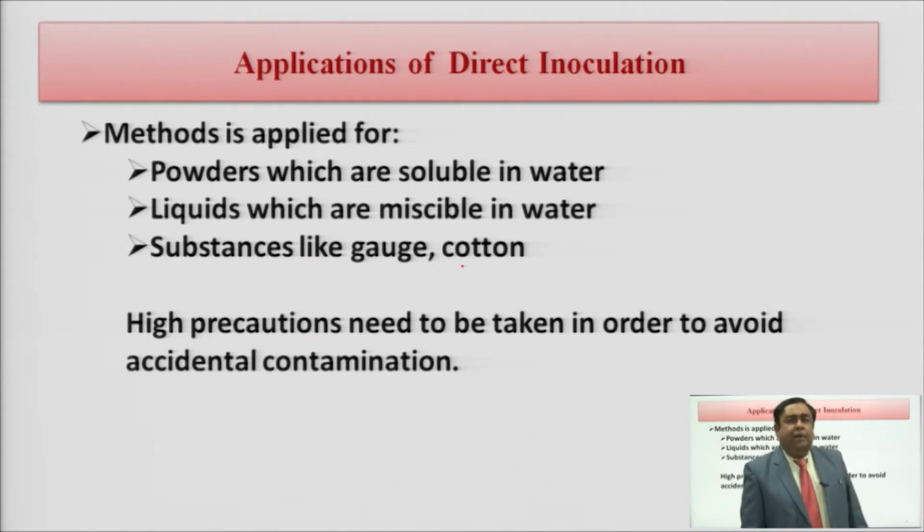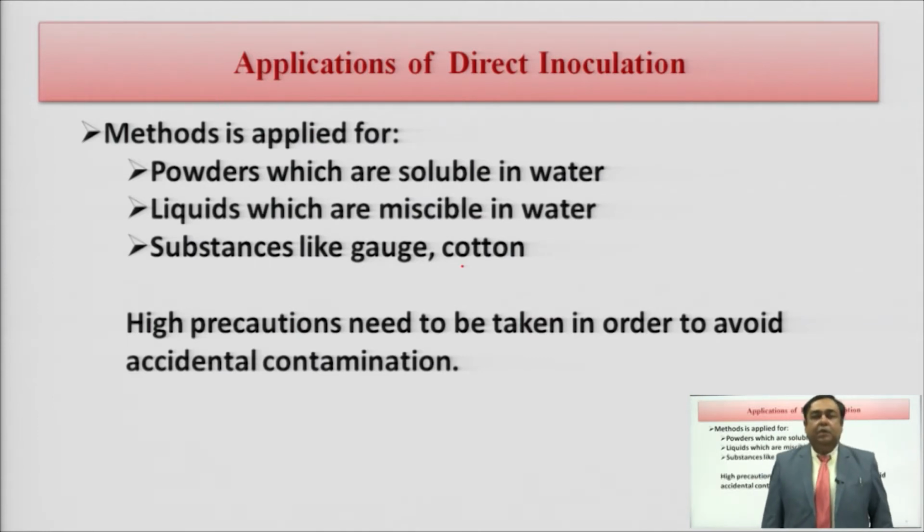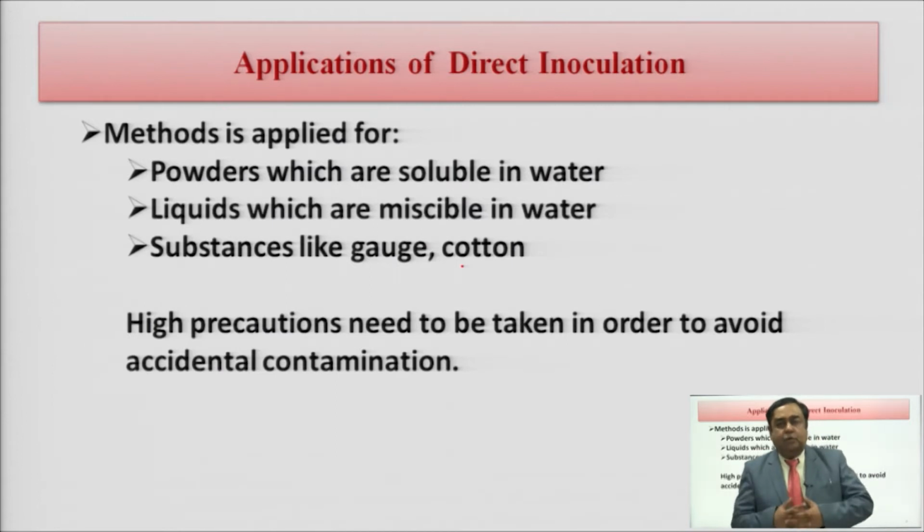We have to maintain one common precaution which I have told you in the earlier classes also: whenever you are carrying out these tests for sterility, you have to be very sure that the area where you are carrying out this test is absolutely free from microorganisms.